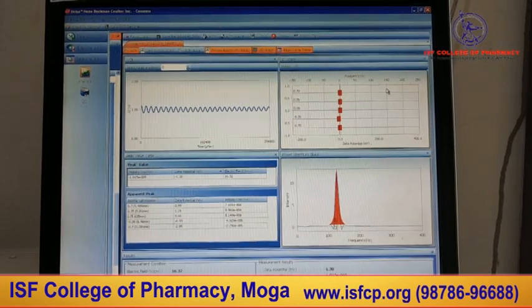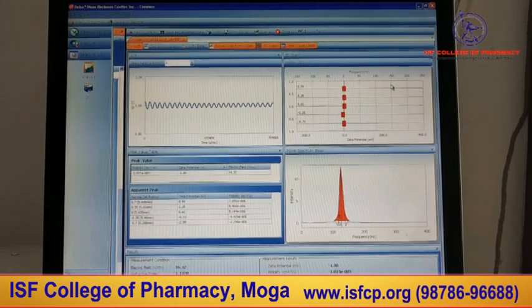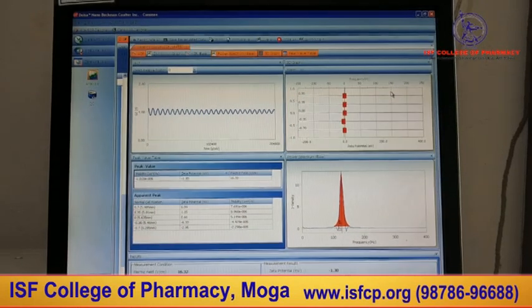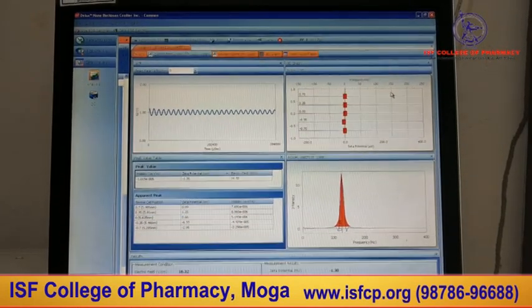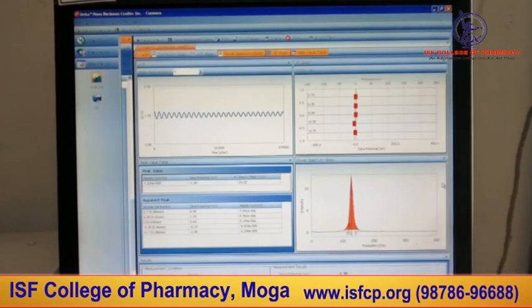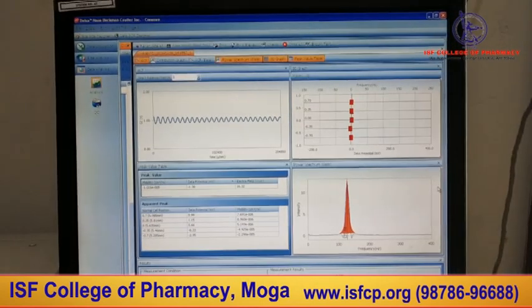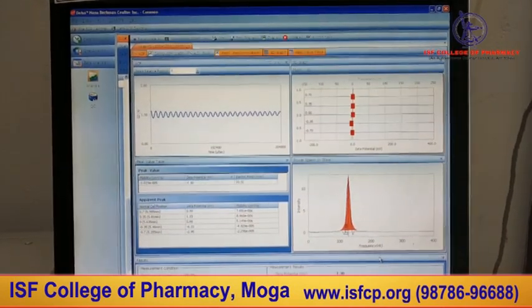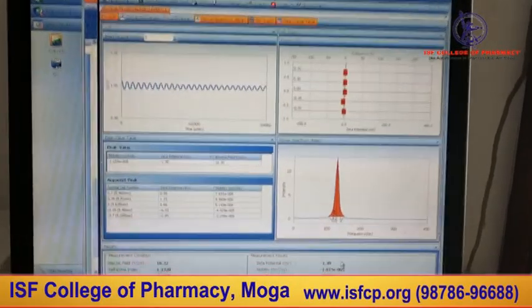Selection of our excipients like cholesterol, soy lecithin, oleic acid, the formulation comprises cholesterol. So we can see our Zeta potential is negative, minus 1.30.